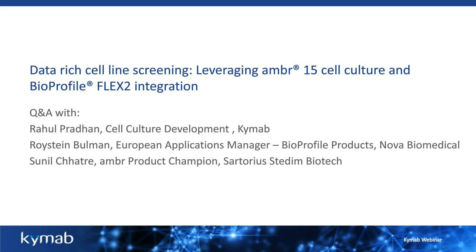Sunil, is there anything you'd like to add to the engineering requirements for the integration? Not specifically, no. The Nova Flex is purchased separately from the ambr15. So what typically happens is a customer would purchase the Nova FLEX2, it would be installed and commissioned by Nova Biomedical, and then Sartorius would come along and perform the final hardware and software hookup to make sure the two systems spoke to each other.